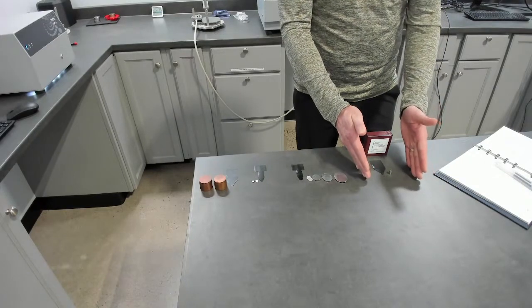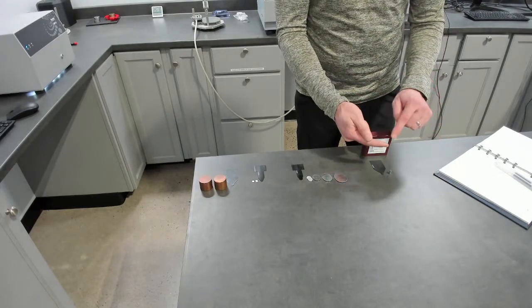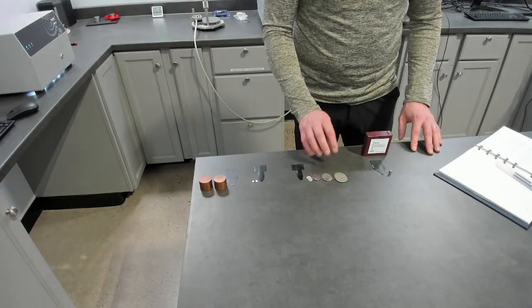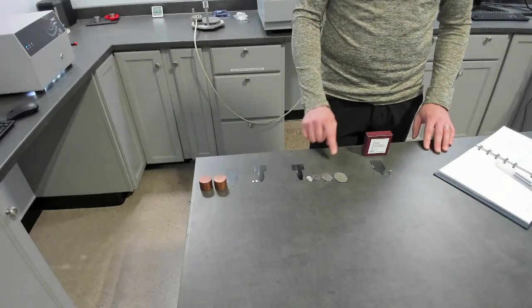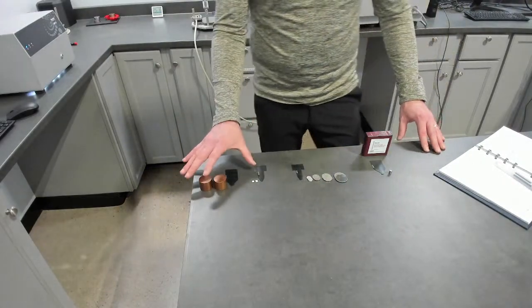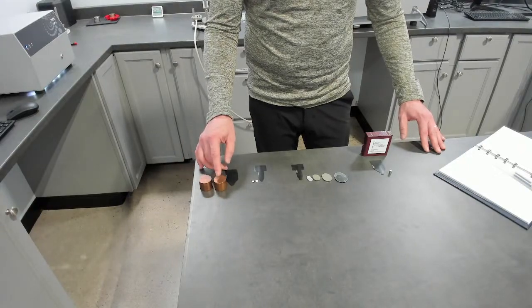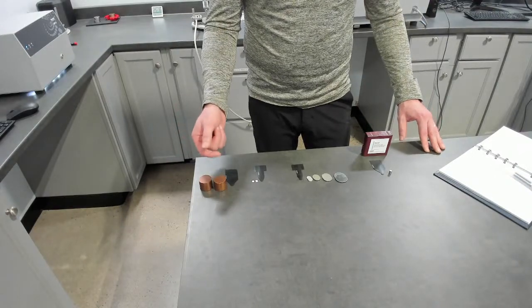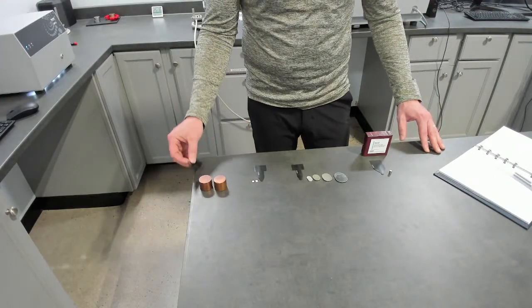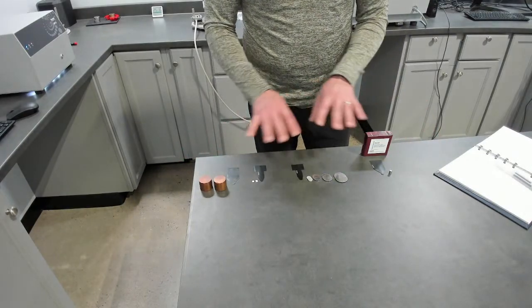So in 1D, it's along the length of the rod, whether it's symmetric or asymmetric. Slab, it's along the in-plane direction of the isolated direction, which is in plane. We're isolating the thickness, sorry. And on bulk, it's all directions. So in this case, it's the smallest dimension from the edge of the sensor to the edge of the sample, both considering thickness as well as when the sensor is centered. So that's a little discussion on the importance of test time.